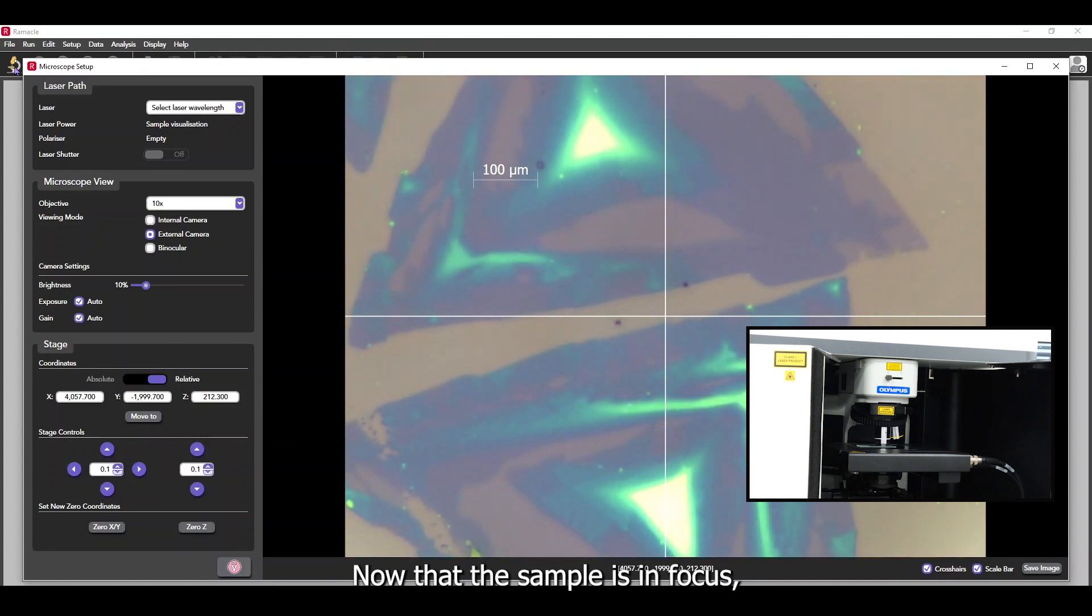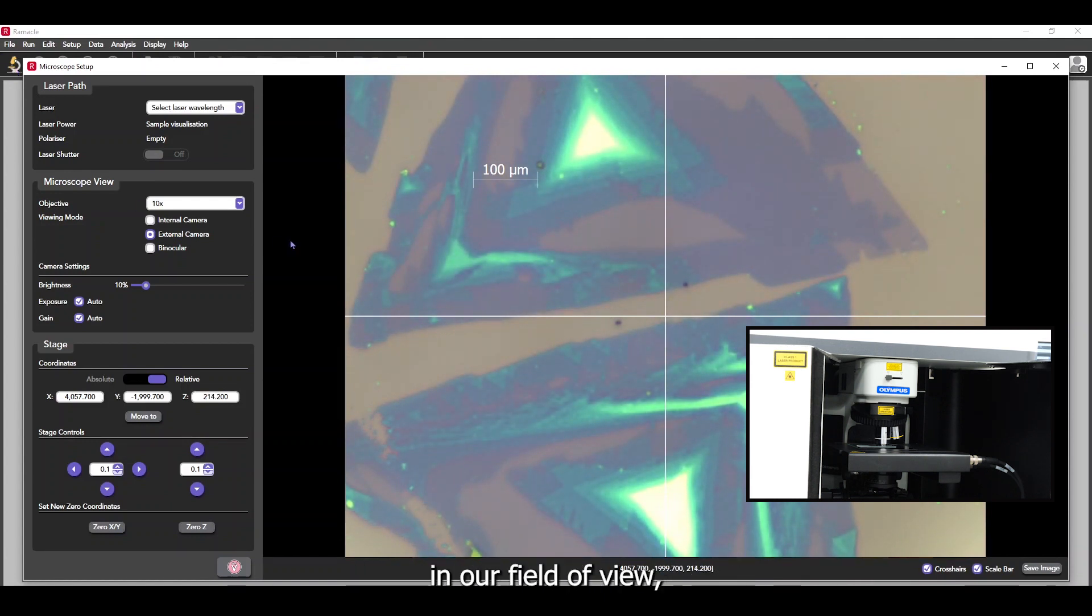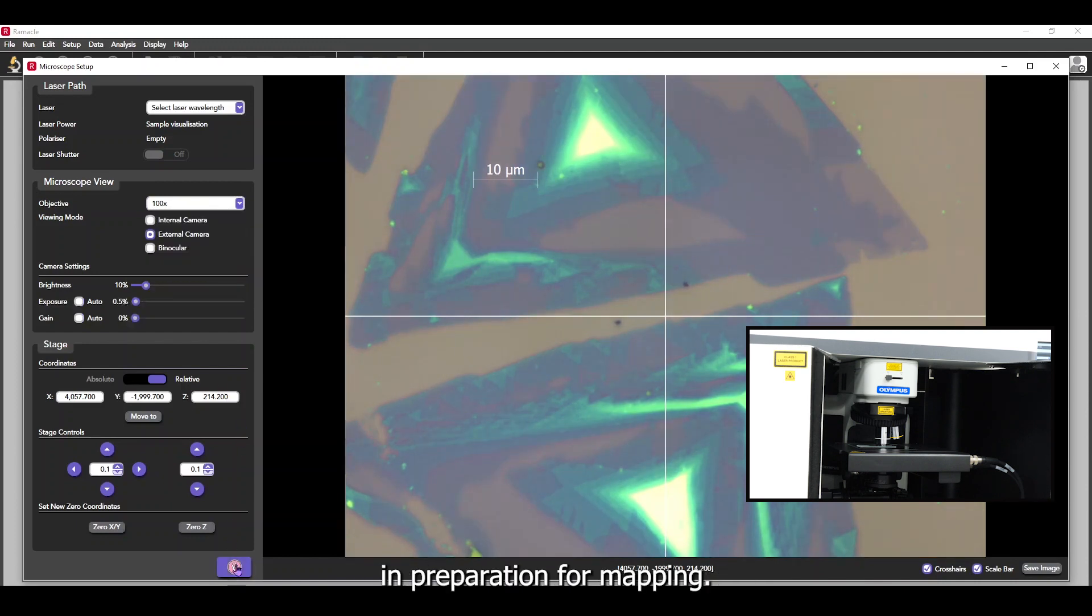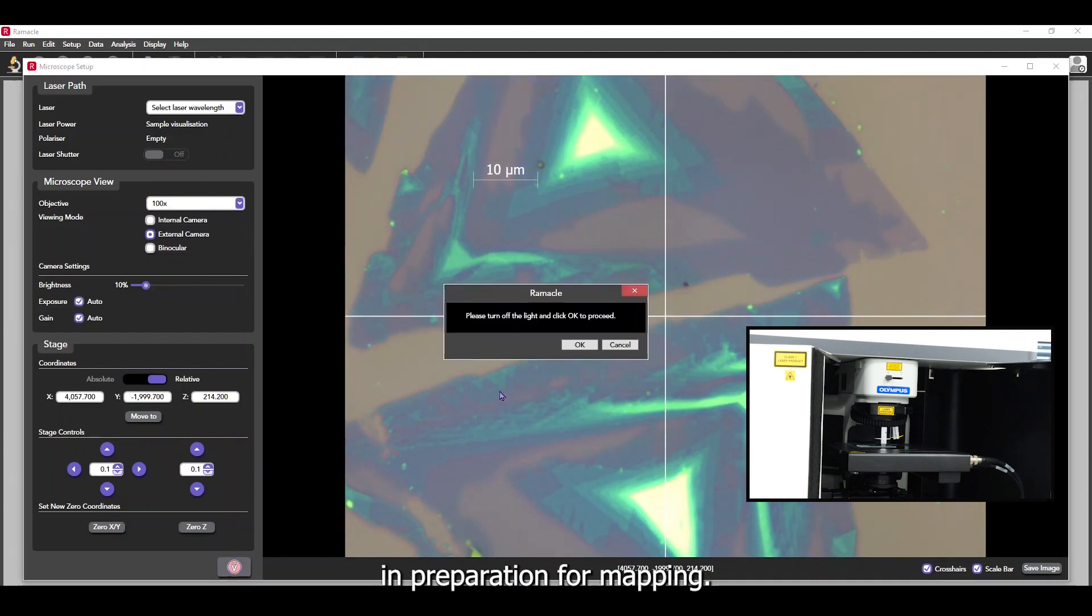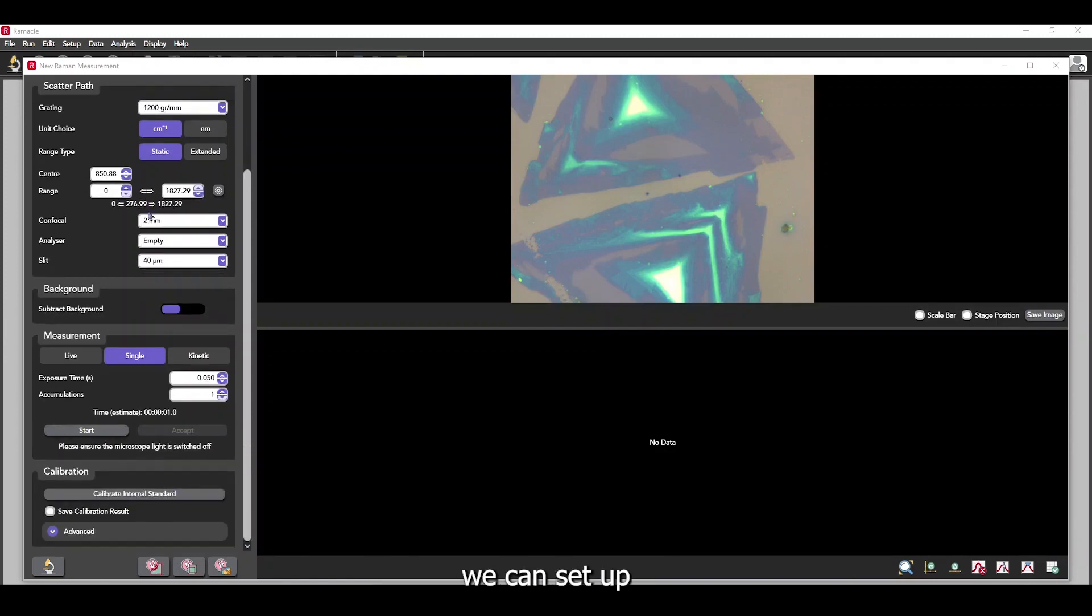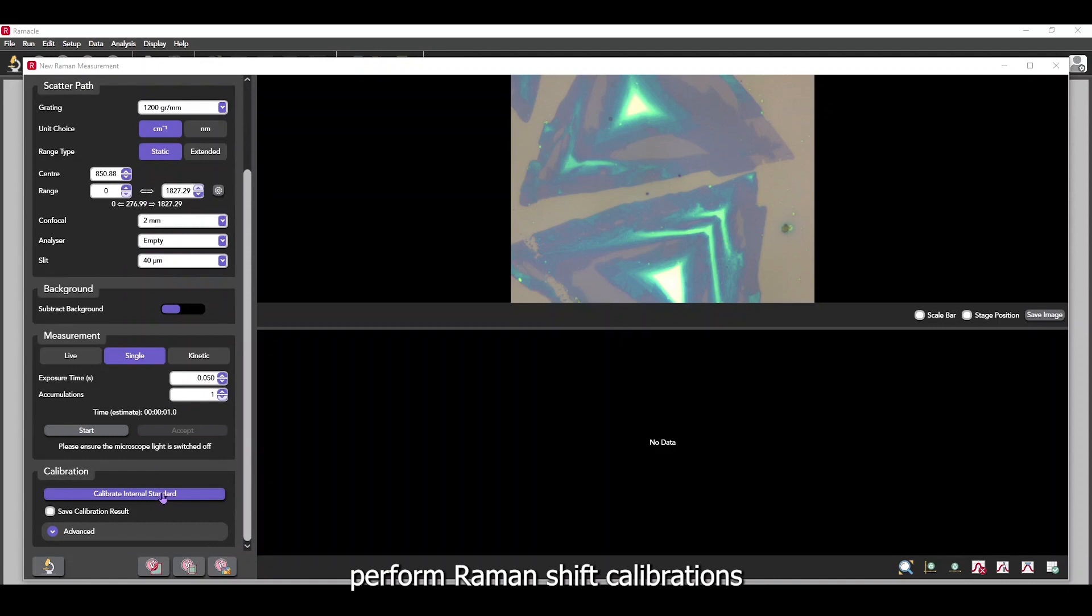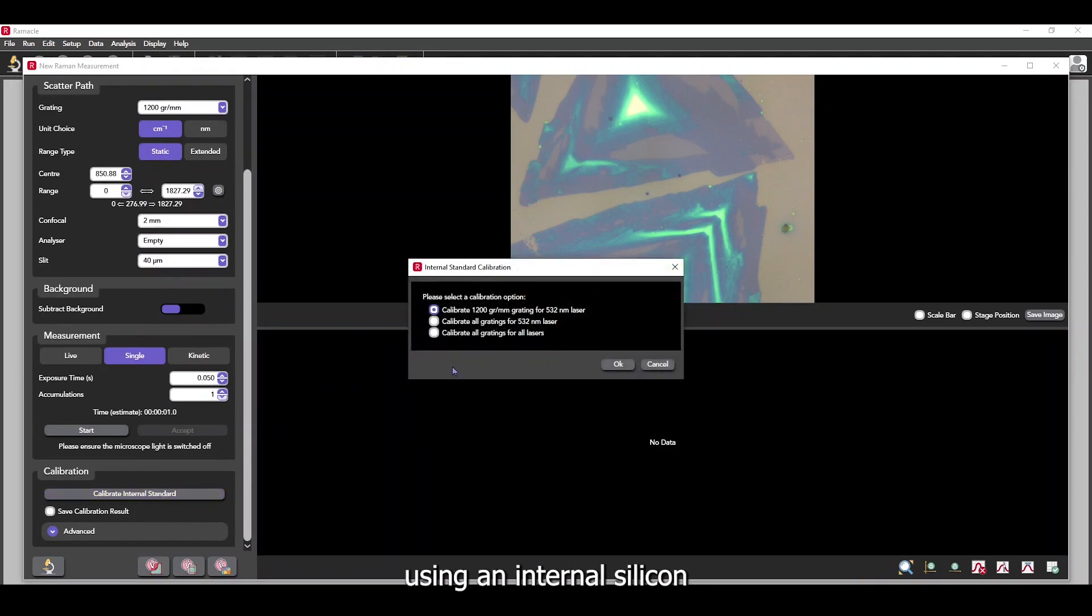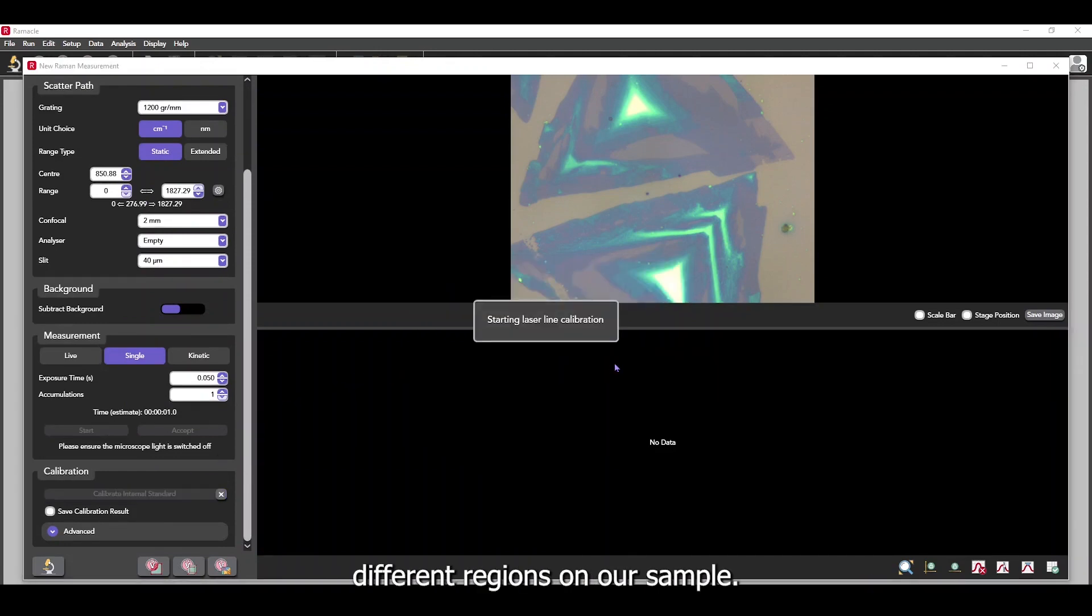Now that the sample is in focus and we have a region of interest in our field of view, we can use this microscope image to perform spectroscopic analysis in preparation for mapping. In the measurement window, we can set up our spectral parameters, perform Raman shift calibrations using an internal silicon standard and measure different regions on our sample.